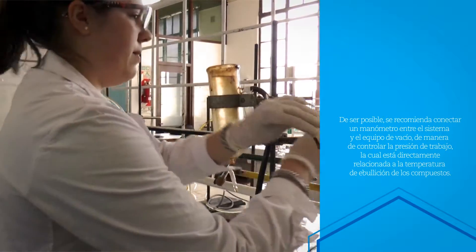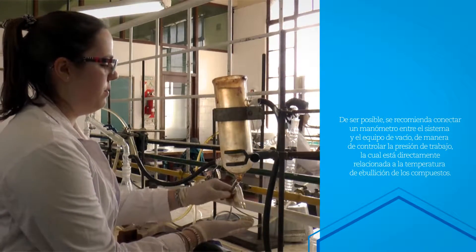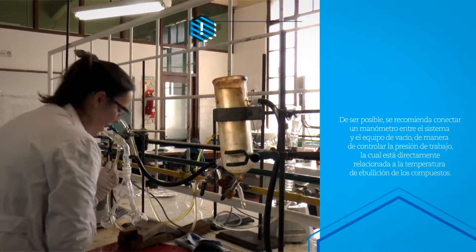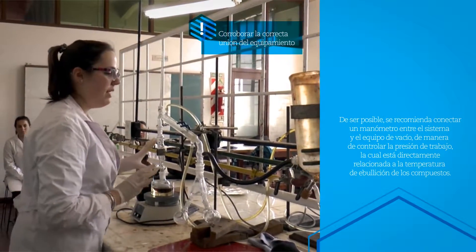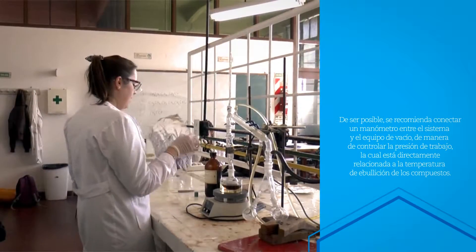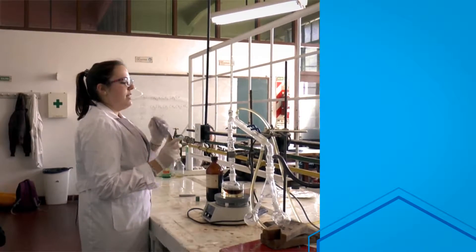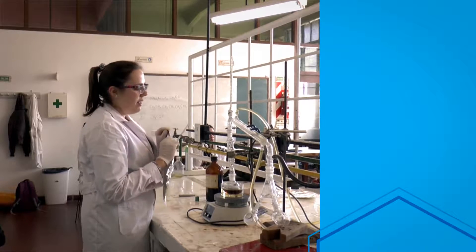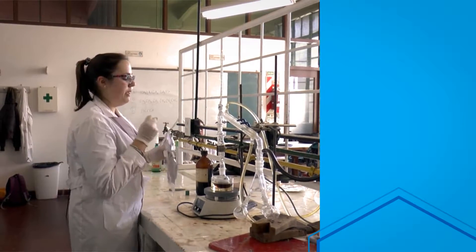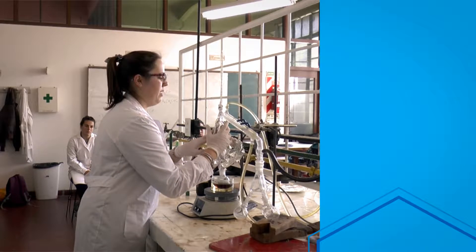Ya estaríamos. Vamos a prender la bomba. Cerramos hasta que no escuchamos más nada. Acá hay que corroborar: si escuchan algún ruidito por algún lado del equipo, quiere decir que se les está escapando la presión. También pueden usar papel aluminio o algún trapo alrededor de la columna de fraccionamiento para mantener mejor la temperatura y que no se escape calor por cualquier lado del equipo.